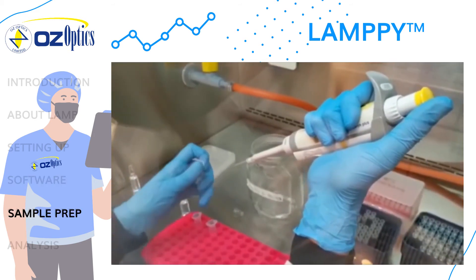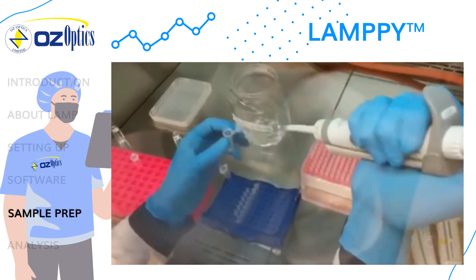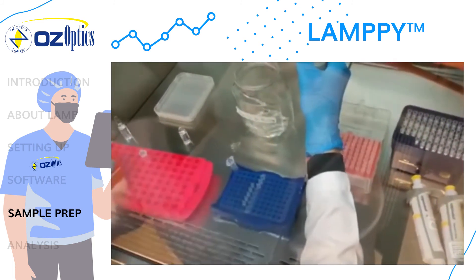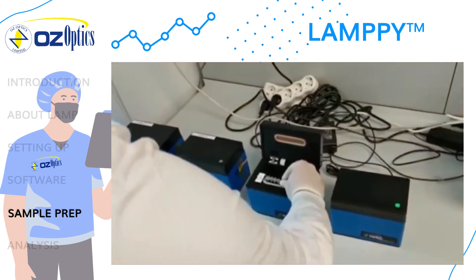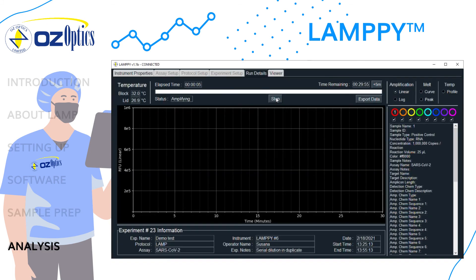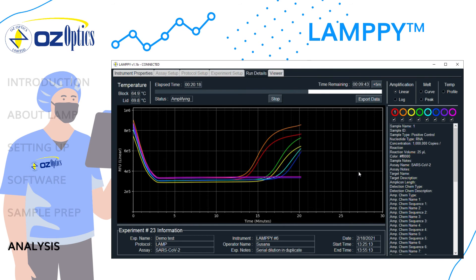We will prepare an 8-strip with a LAMP solution using a serial dilution of synthetic SARS-CoV-2 RNA in duplicate. Tubes 1 and 2 will contain 1 million copies. Tubes 3 and 4 will contain 100,000 copies. Tubes 5 and 6 will contain 10,000 copies. Tubes 7 and 8 will be no template controls. When the samples are prepared, cap the strip and place the tubes into the instrument. Now that the samples are placed into the instrument, the run can start by clicking start. Measurements will take place every 10 seconds. The export data button can be used at any time to save the data set. An automatic backup can be found in the autosave folder.